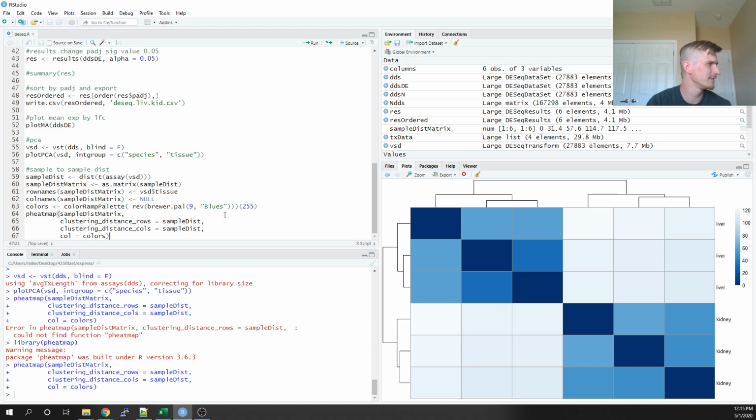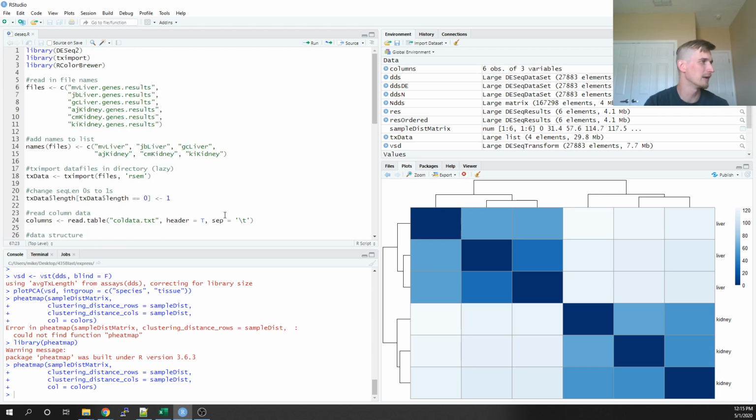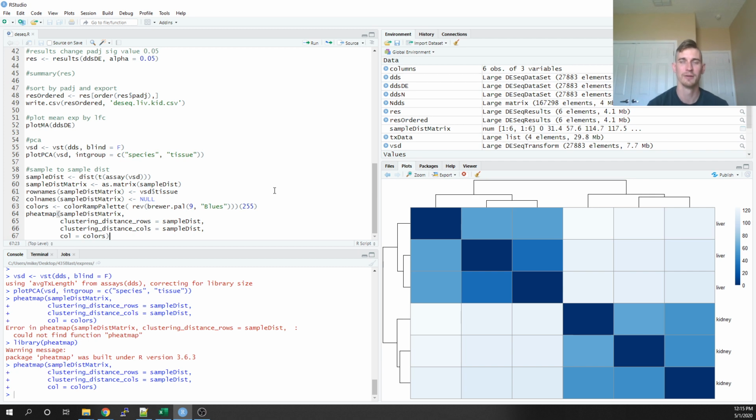So 67 lines of code, that's not too bad. R scripts can get pretty big. We measure how many words are needed to do anything as a metric of verbosity. Anything that's really verbose takes a lot of words to do anything. So C++ is super verbose, Java is really verbose, Python's not verbose at all, awk is even less verbose, and R is somewhere in the middle. It does take a lot of lines to do anything, but it's not the most of any programming language.